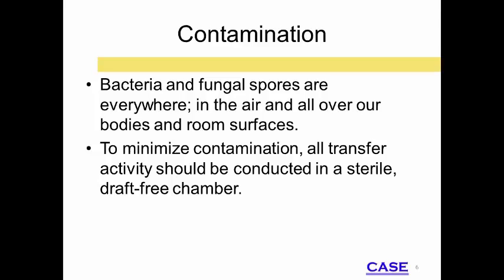The best way to sterilize is to use intense heat or pressure. Unfortunately, intense heat and pressure will also destroy the living plant tissue. Sterilization for tissue culture is primarily done by the use of alcohol-based chemicals.